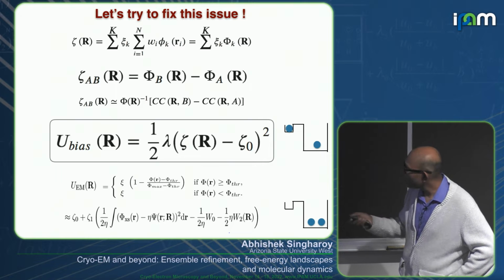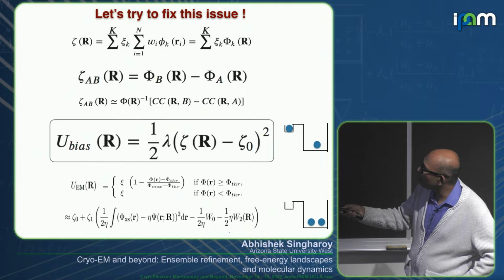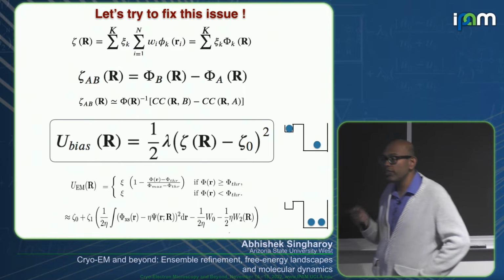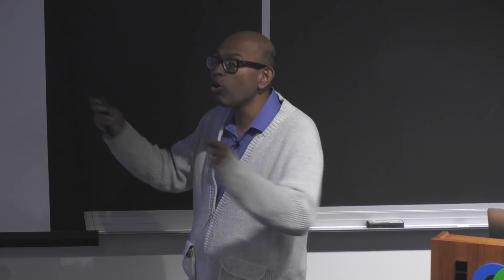That's out of the first term. The second term, however, if you do the square, that remains a derivative of a density. And the derivative of a density is important because the forces coming from the derivative of a density are long range forces.